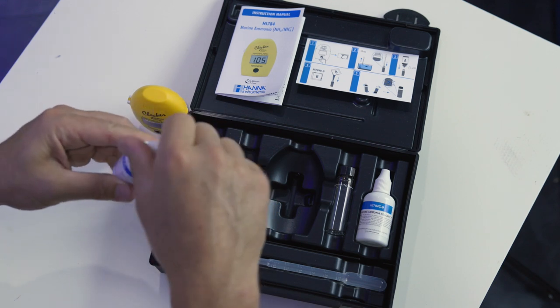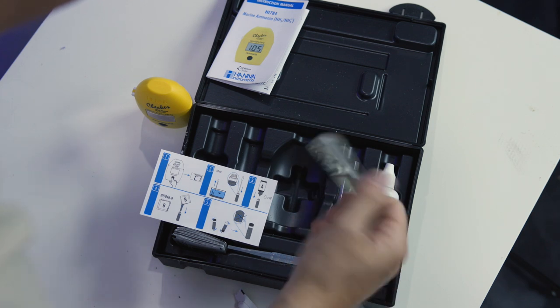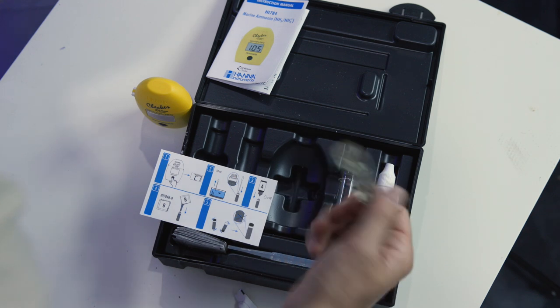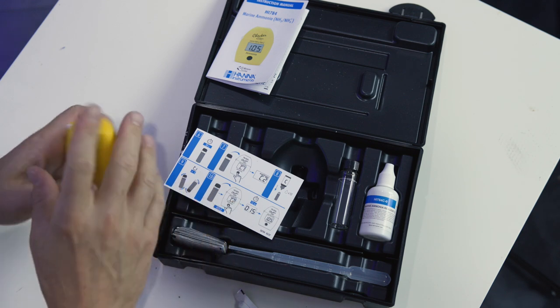Next, add 18 drops of reagent A — yes, count out 18 drops. A syringe with instructions to add 0.5 or 1 milliliter of reagent would be nice, as that's easier than counting out 18 drops. Perhaps Hanna decided users were better at counting drops than measuring with a syringe — I don't know, I'm not in R&D, this is a first impressions show. Next, add a packet of powder reagent, then invert the vial until all the powder is dissolved. Just make sure you don't shake the vial per the instructions. Then let it sit for 30 seconds to allow air bubbles to rise, and press the button on the checker to zero it.